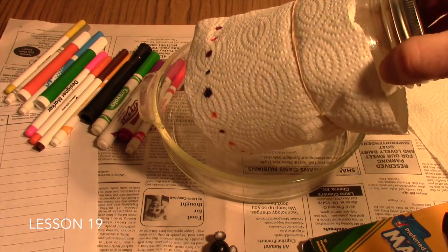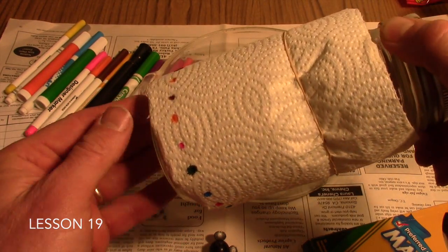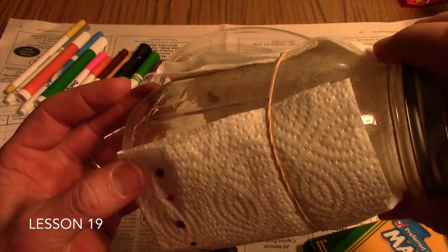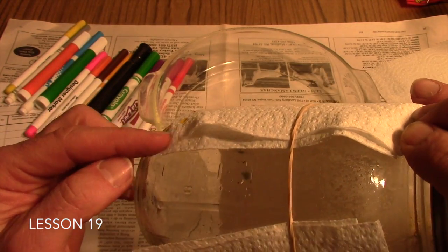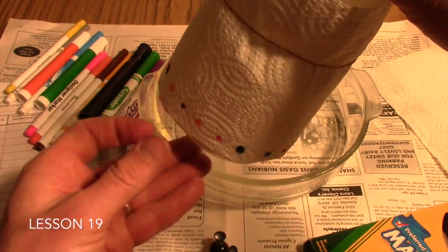As you can see here, we've made spots all the way around the base of our paper towel, and we're ready to lower it into the solvent. It's important to realize that you don't want your spots to overlap so that the colors of one spot bleed onto the side of the other. So I've got it ready to go here.